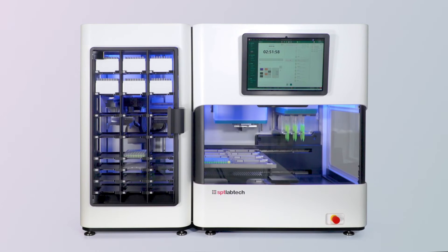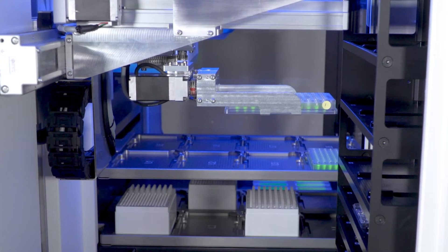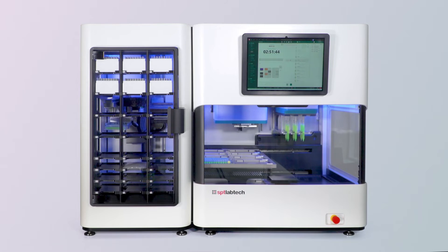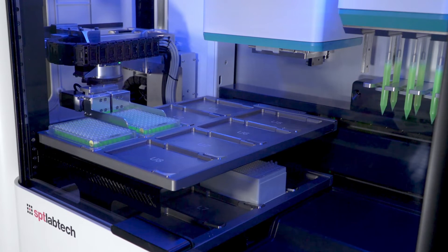Now the gripper will move and collect the plate that you can see in one of the middle shelves. This plate will get picked and placed into the upper deck of the Firefly module. The shelves on the front of the expansion or PLUS module can house SBS footprint labware, and we have shelf space for up to 15 tip boxes.